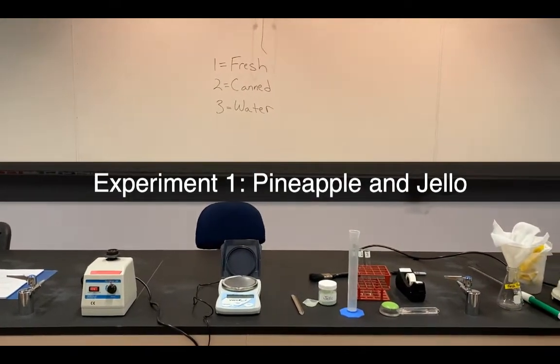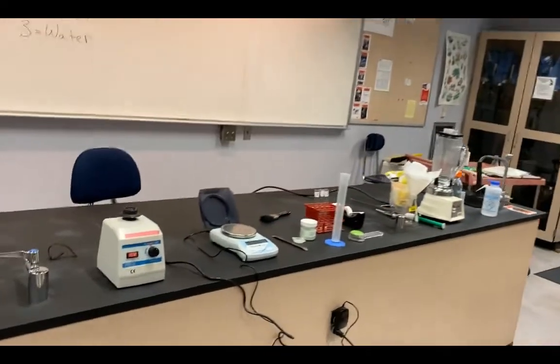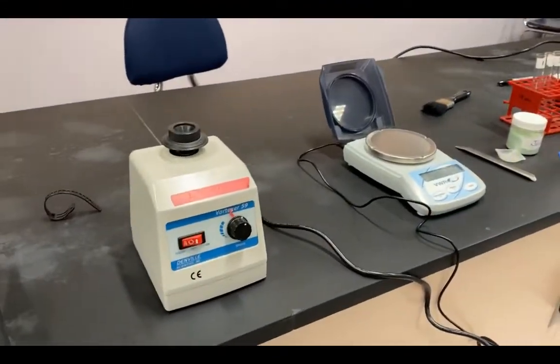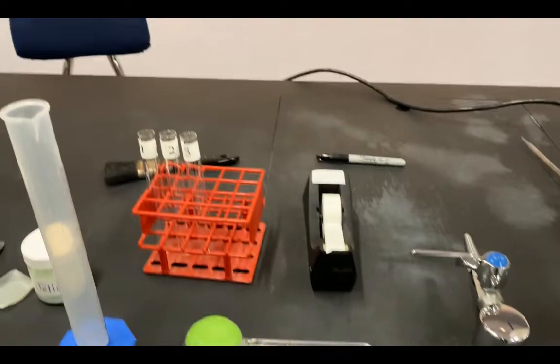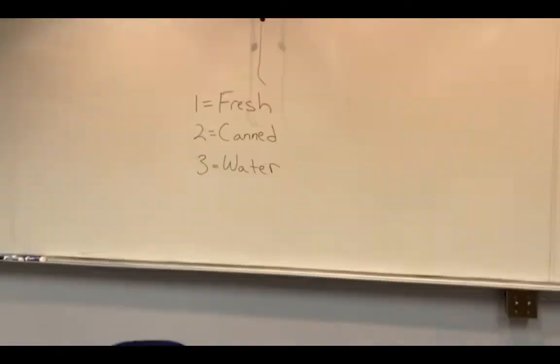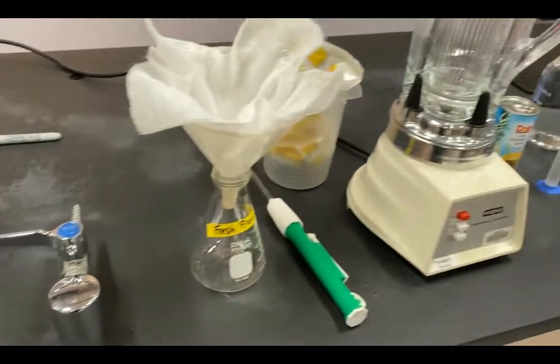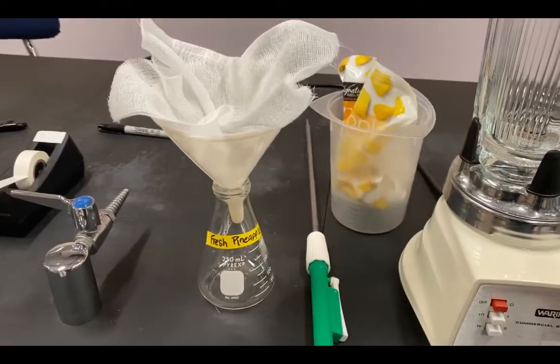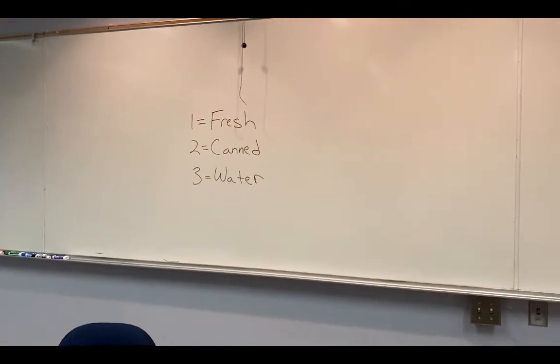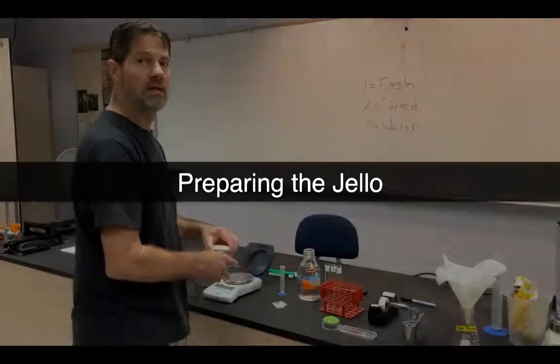This is experiment one for the enzyme and metabolism lab. Here we have a vortexer for mixing in our test tubes, a balance to measure out jello, three test tubes for the fresh pineapple, canned pineapple, and water conditions. We'll blend fresh pineapple and strain it through cheesecloth to get juice, and for canned pineapple we'll use the canned version directly, along with water to add to the solutions.